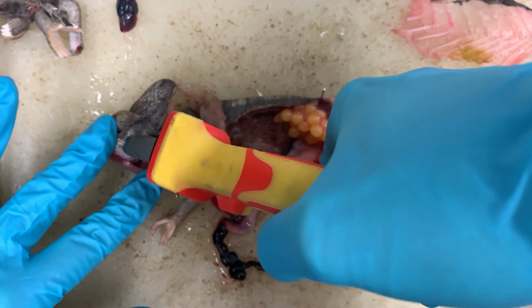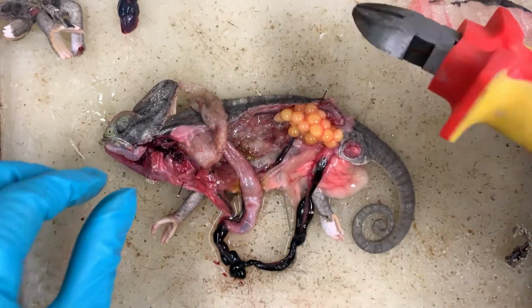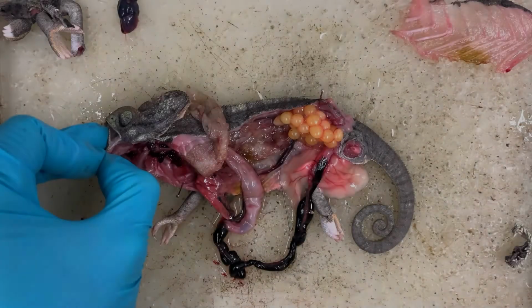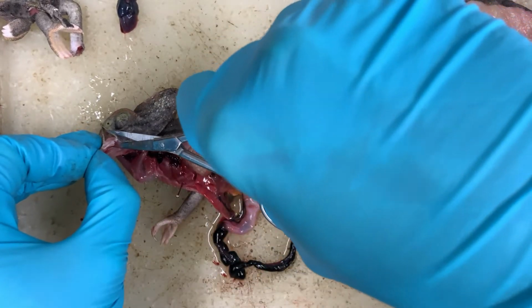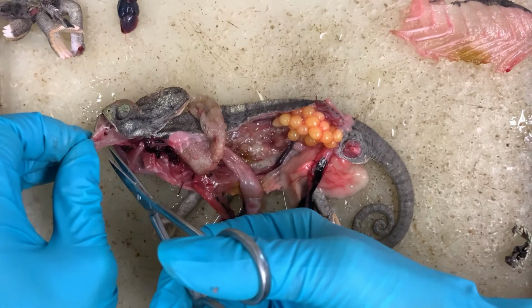We need to break through the quadrate bone using wire cutters in order to remove the lower jaw. At the anterior end, we cut through the medial symphysis of the two lower jaws.